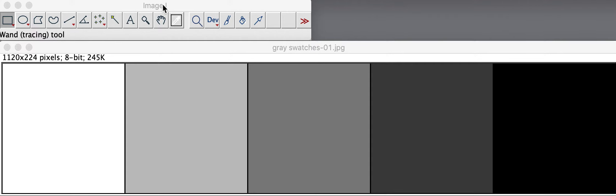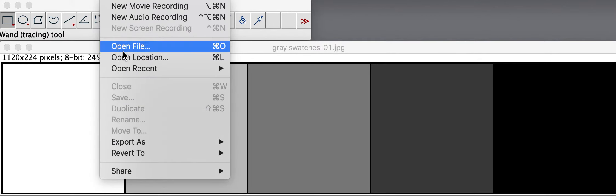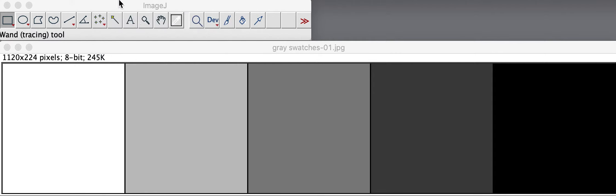In this case, I've opened the ImageJ program and I've used the File Open menu to open an image file, in this case a file called grayswatches.jpg.